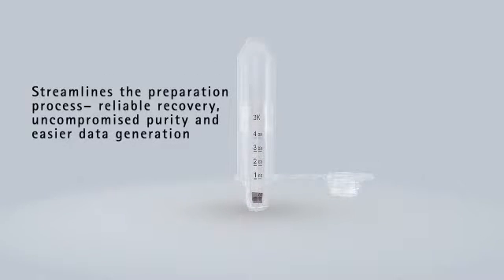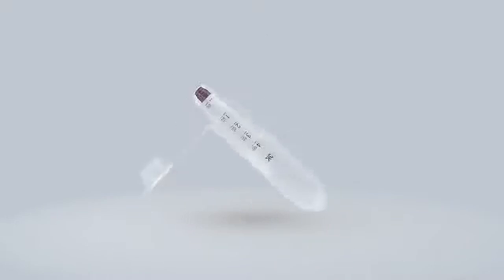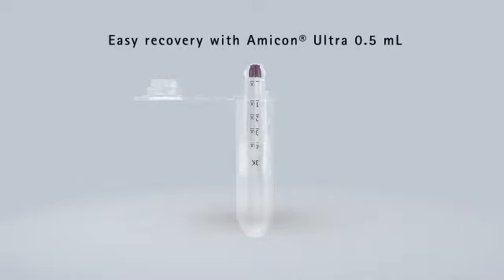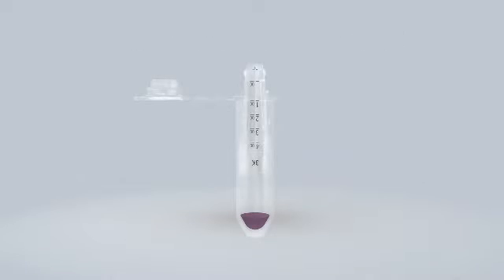The Amicon Pro system provides consistent sample recovery at the right concentration in your buffer of choice. Easily recover your sample from the Amicon Ultra 0.5 attachment by reverse spin.